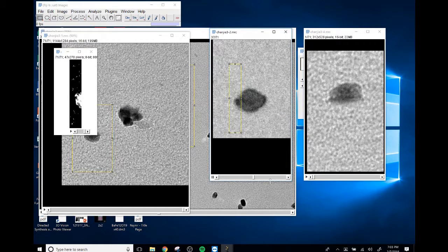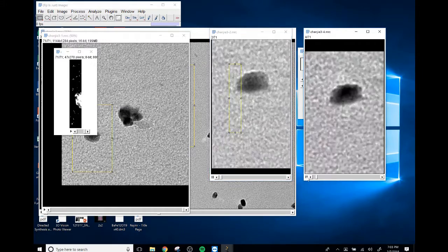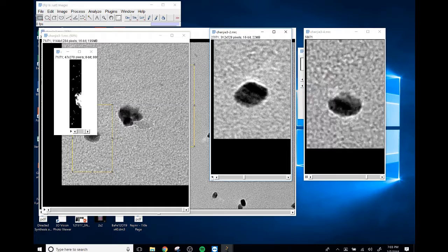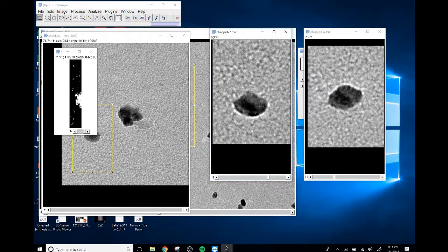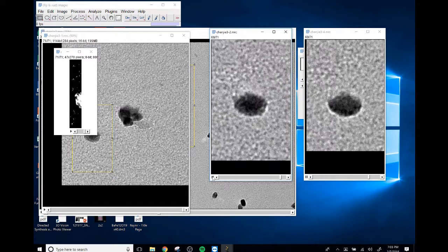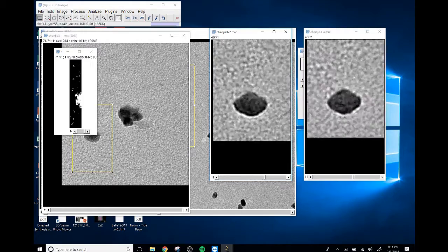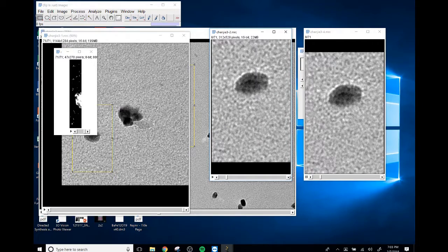So here's the regular one, right? And we'll see if we can catch it just at the right time. There's the new one. Let's see if we can catch it. So hopefully you guys can see the difference here. Oh, I didn't catch it at all. There. All right, so hopefully you guys can see the difference now between these two stacks. This one had more vertical drift, but this one is now fixed in place very nicely. Okay, so that means I'm very happy with this.